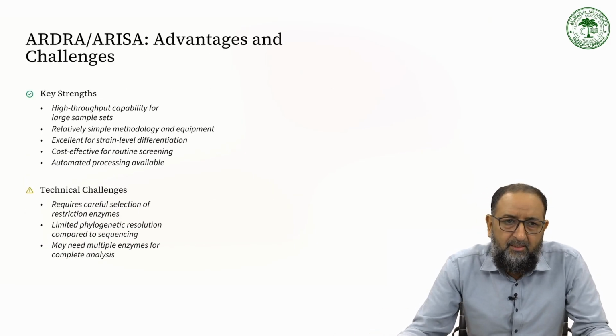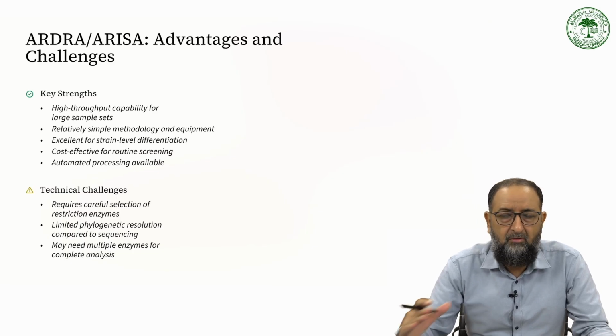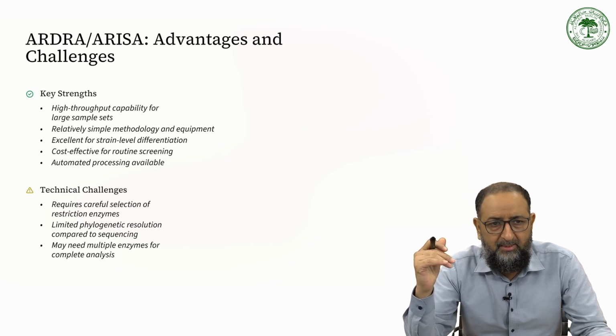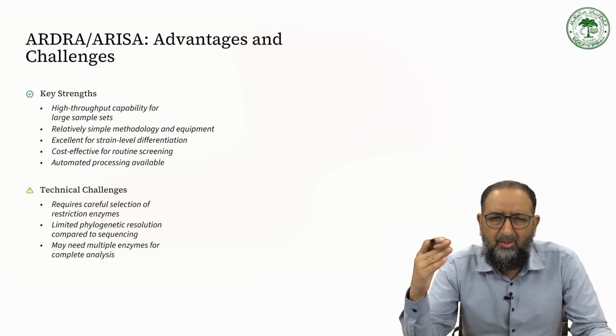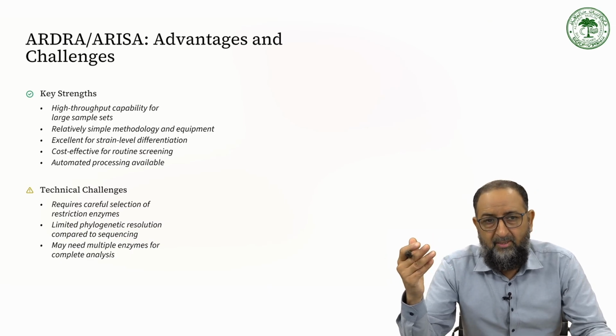The key strength is high throughput capabilities for large sample sets. So large sample sets can be easily identified through this method. It has relatively simple methodology and equipment, is excellent for strain level identification, cost effective for routine screening, and automated processing is available.